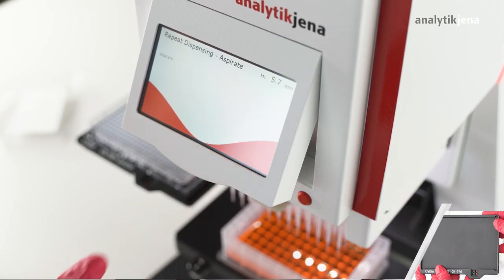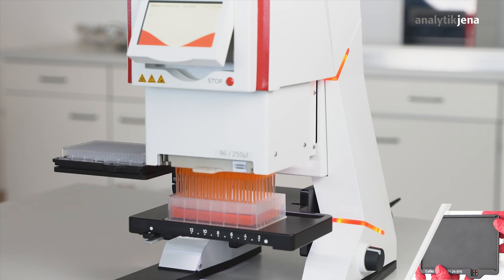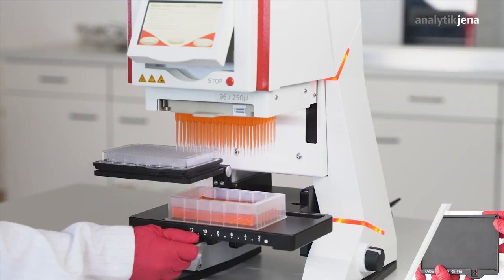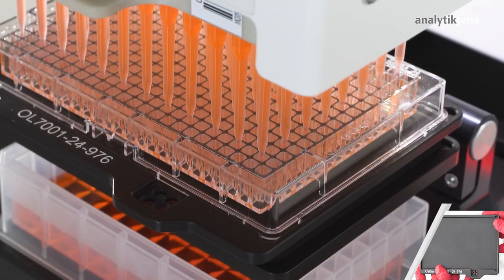Now the aspirate step is in progress. In this example, 210 µL will be aspirated. The spring lever is then used to shift the 384 target plate with the 384 microplate adapter to working position 2.